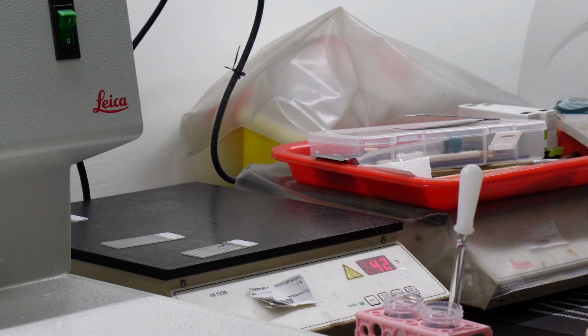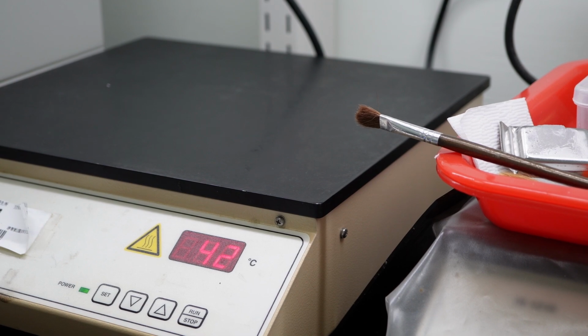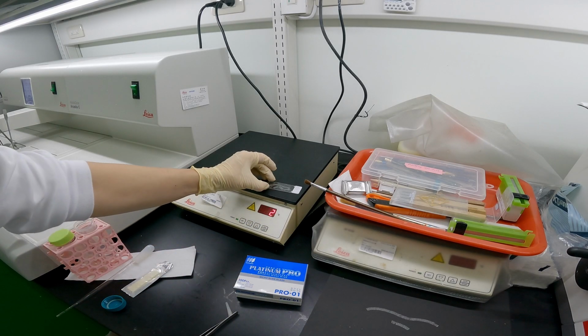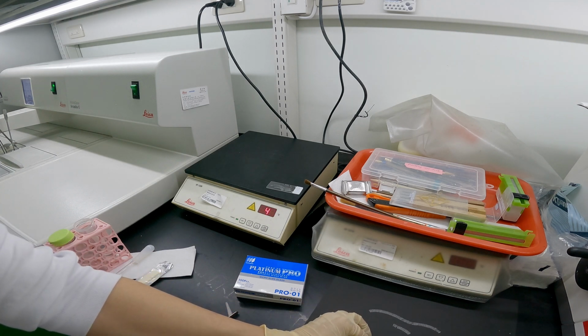And then the slides need to dry properly. Yes. Usually you place them on a slide warmer or hot plate, set to maybe around 42 degrees Celsius, often overnight. This helps the paraffin melt just a tiny bit, making the tissue section stick firmly to the glass. So they don't wash off during staining later? Exactly. You don't want to lose your precious sections halfway through the process.